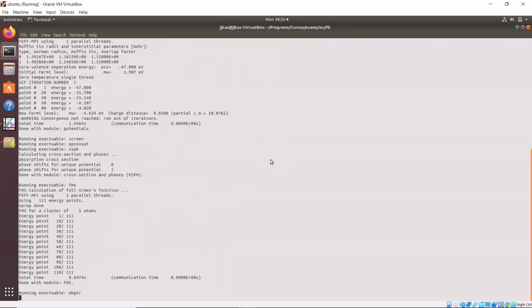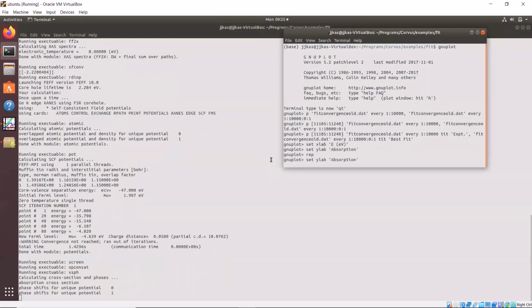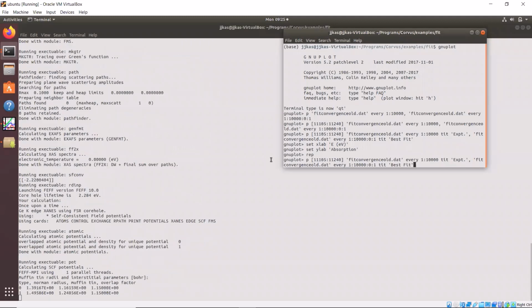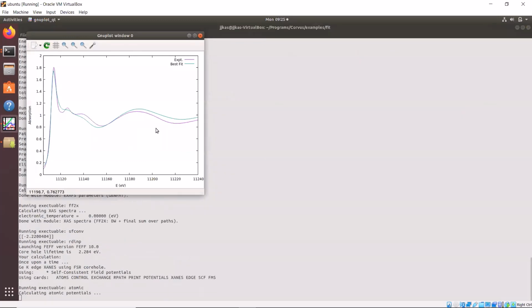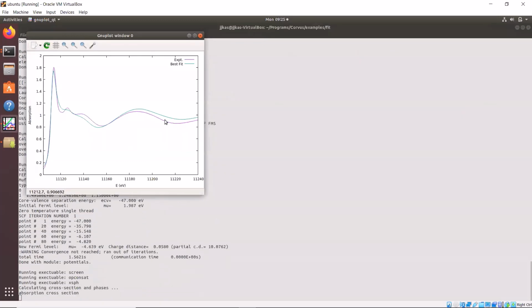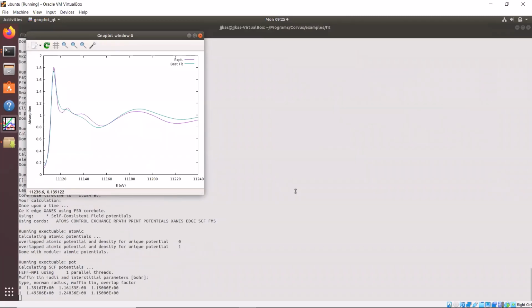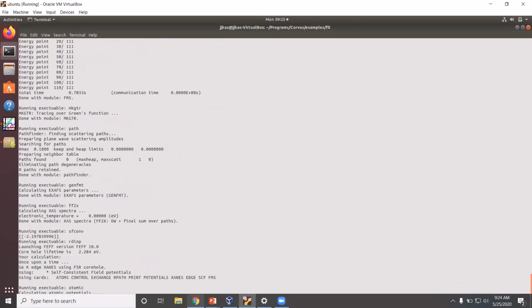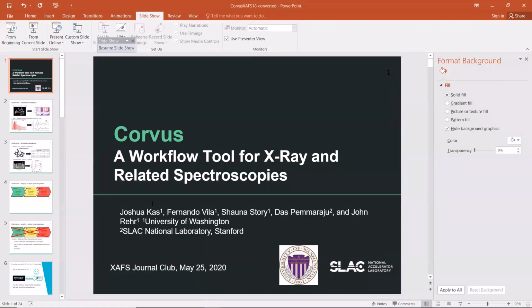It would run for probably quite a while here because it's doing a fit, but then you might take a look at exactly what things look like. Right now, it's just going to show the very first iteration, but in particular, you see a fit there, and at the end, it will give you all the parameters as output, of course. So I think this will be pretty powerful and useful.